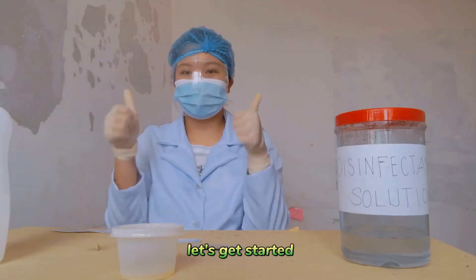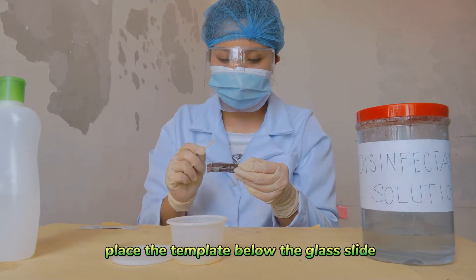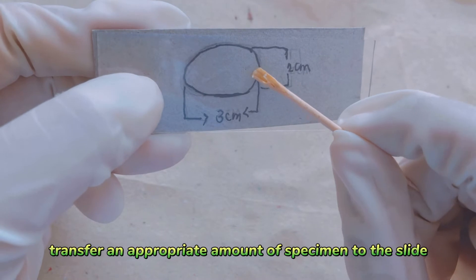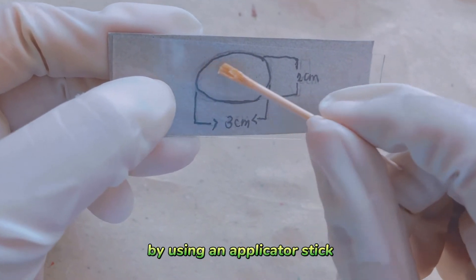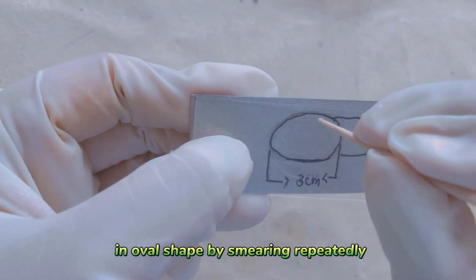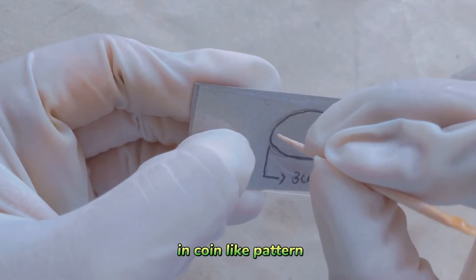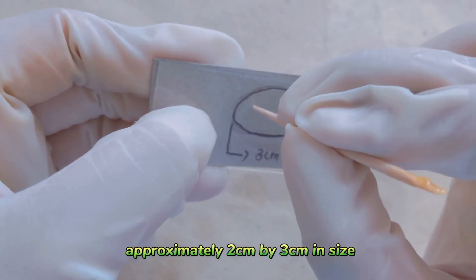Let's get started! Place the template below the glass slide. Transfer an appropriate amount of specimen to the slide by using an applicator stick. Spread the sputum on the slide uniformly in an oval shape by smearing repeatedly in a coin-like pattern, approximately 2 by 3 cm in size.